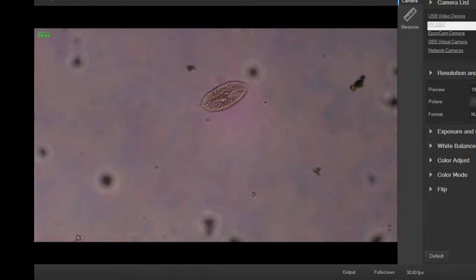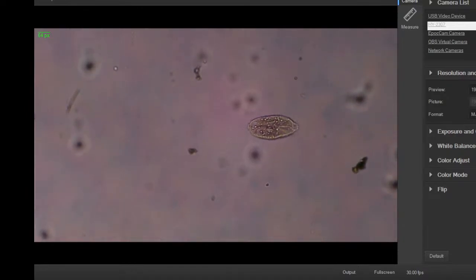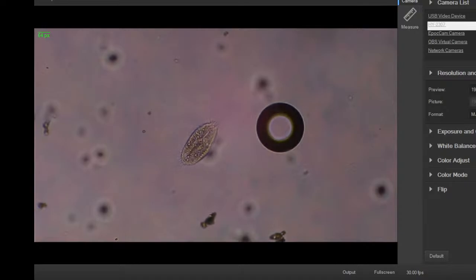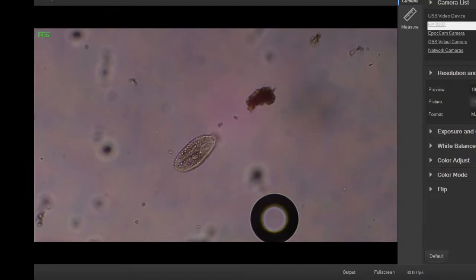I had to look it up again, but I think Stylonchia is actually a genus, not just part of a family name. So some of these movements might be a diagnostic to help you identify them, because some of these animals and microscopic plants can be very hard to identify without really good scopes, really good conditions, and some painstaking work.